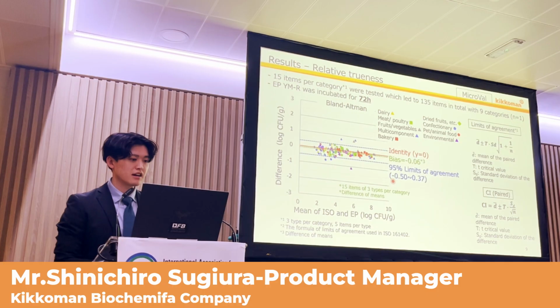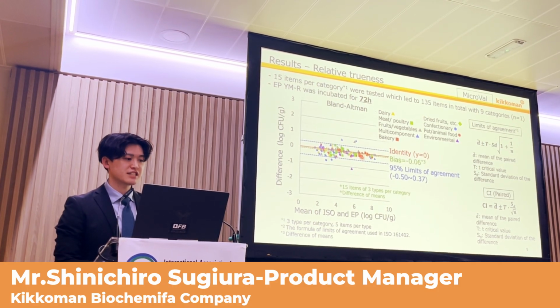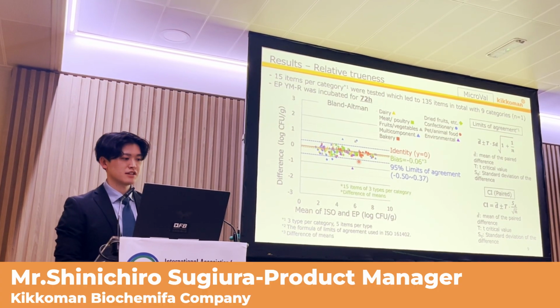And the data were also represented in Bland Altman, which is suited for the intuitive understanding of the agreement between the methods.